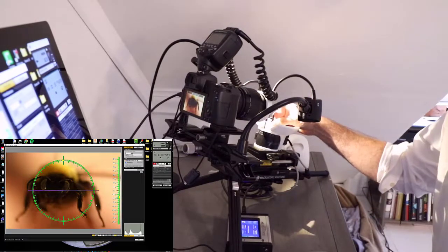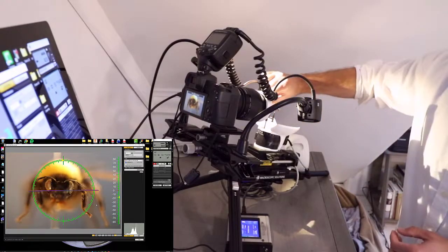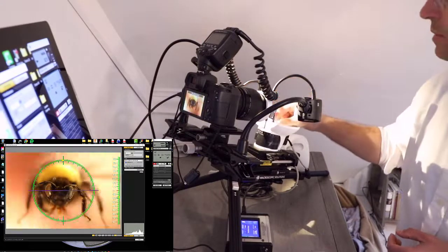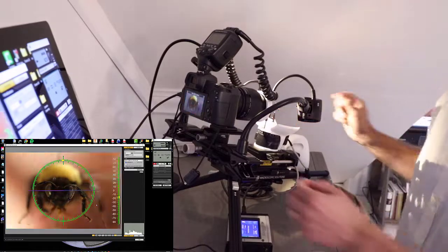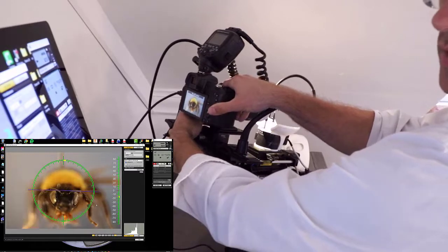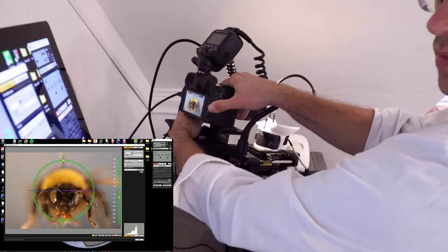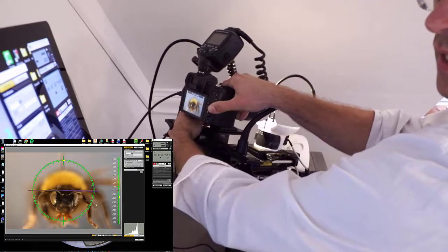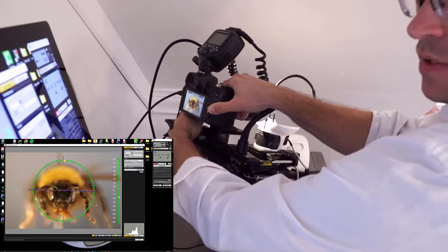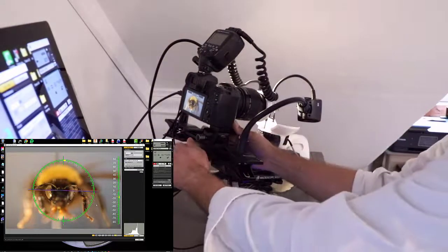Okay, now what we'll do is just get everything nice and centered. So the nice thing about this stage here is it gives me a good deal of flexibility in terms of how I would like to orient, but also while keeping my specimen quite centered. If everything is not quite level, we can also turn the dial on the lens here on the foot plate. That allows us to rotate in a clockwise or counterclockwise orientation, so what we can do is use the antennae and the tops of the eyes there to just make sure we have our specimen nice and level for a very aesthetic and well-centered shot.